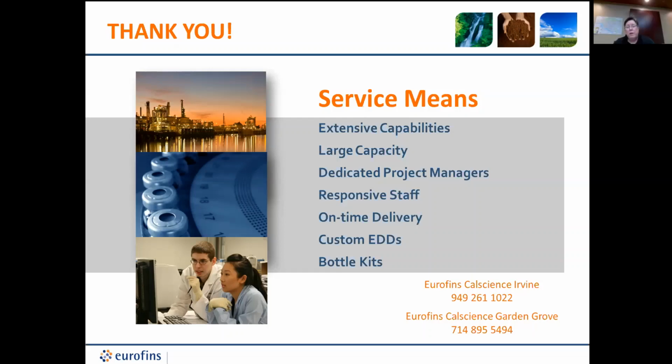They don't label their containers, or they don't complete their COC properly. Those are the two biggest things that we see. Another thing, which is not as frequent, is they'll sample in like 7-Up bottles, or containers that aren't specifically meant for analytical testing. We provide you the containers because we know they're clean. They come with certificates of compliance down to certain reporting limits. So you'd want to use the containers we provide. But sometimes guys are in the field and it starts to rain, and whatever they have in their truck, they grab the sample with. So: proper containers, completed chains of custody, and labeling your containers.